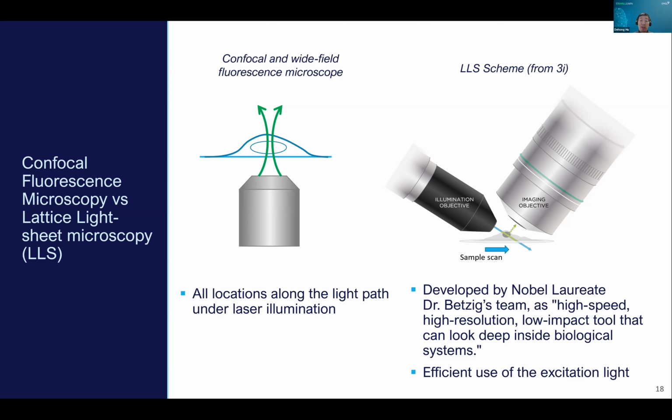Confocal is very popular. Maybe you have one you can access in your institute. And of course, confocal is very good and easy to use. Then the confocal microscope, like many other microscopes, uses the basic configuration shown in the left figure.